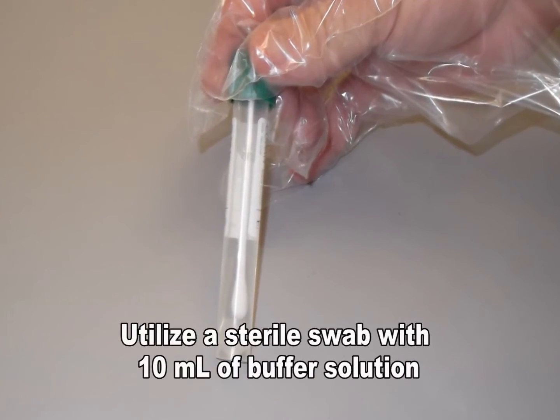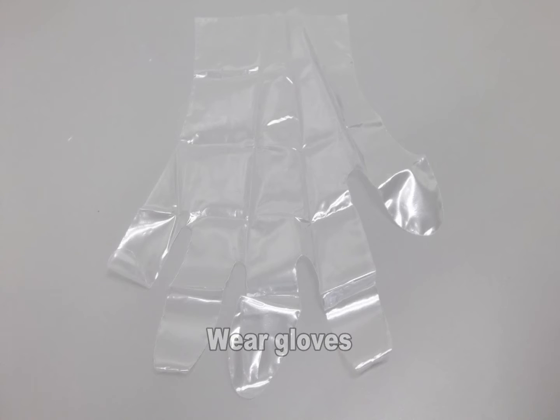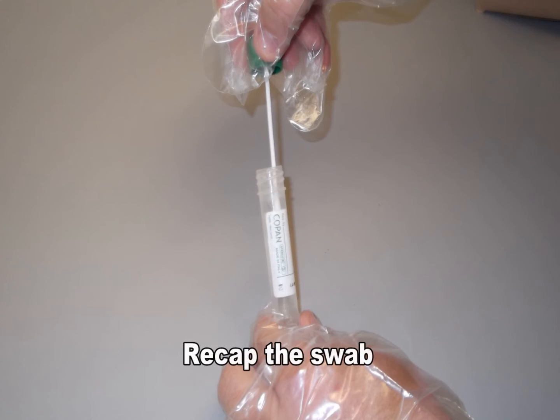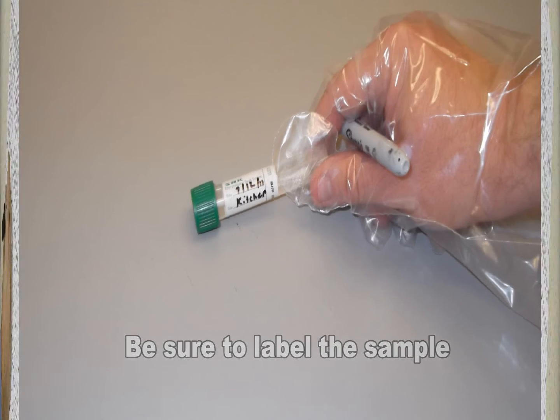Make sure to use the proper swab. It should be sterile with 10 milliliters of buffer solution, and be sure to wear gloves. Uncap the swab and sample the area in question using firm pressure and a serpentine motion. When sampling is complete, recap the swab and label with a unique sample identifier in waterproof ink or permanent marker.